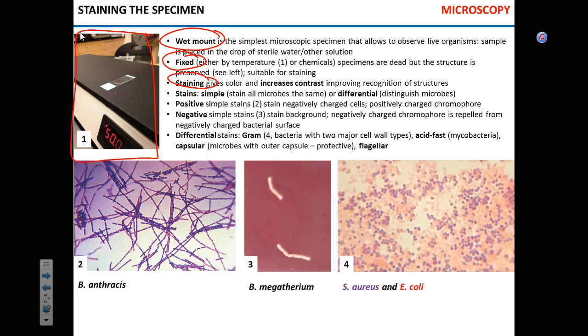What is also important, not just that you killed the microbes. That is cool. Yeah, they're not moving. But you also fried them so they stuck to the slide. Now you can add dyes. You can wash them. Well, not fire hose them, but reasonably wash them. And they will stay on the slide. That makes it super convenient.